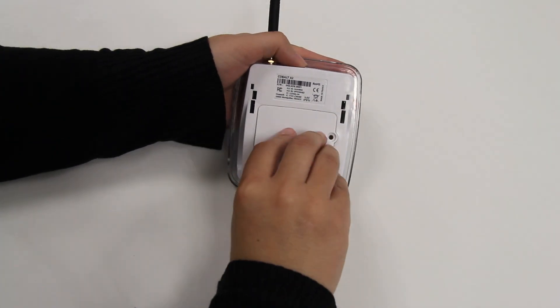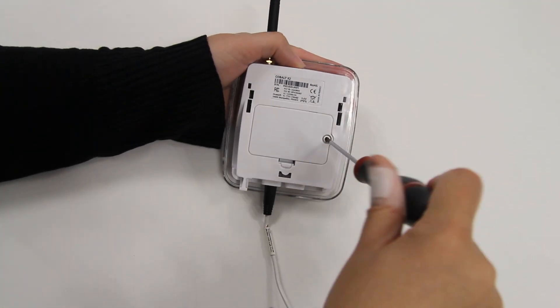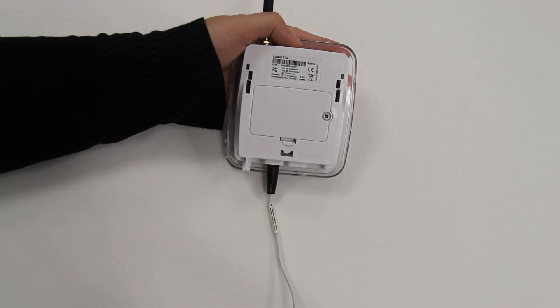Replace the battery cover. Replace the screw and lightly tighten it. Replace the cradle.